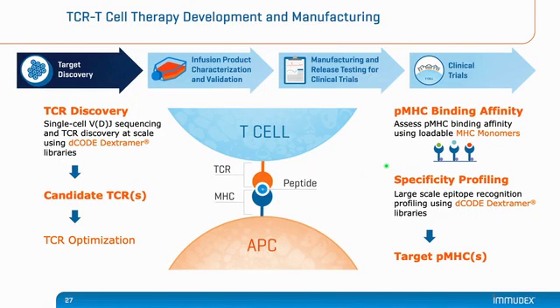So to summarize, the initial steps of TCR discovery typically start with epitope discovery, but following the epitope discovery, you can start looking into specific T cells and the receptor sequences that they carry. And at this stage, it becomes very important to make sure that the TCR is properly validated so that it exhibits the right affinity for your purpose, as well as the right specificity to avoid unwanted cross-reactivity.